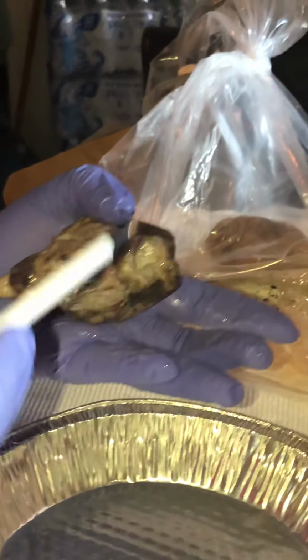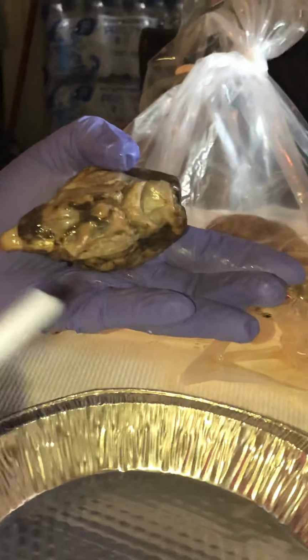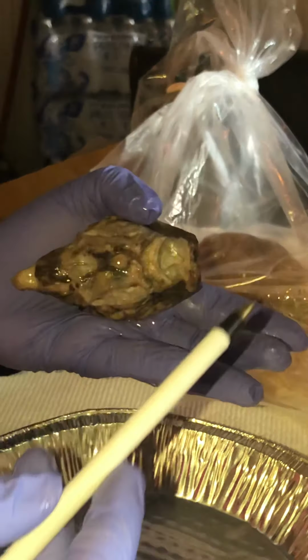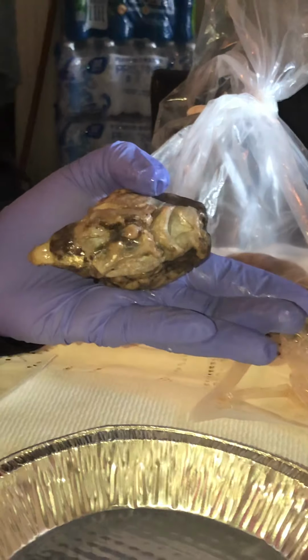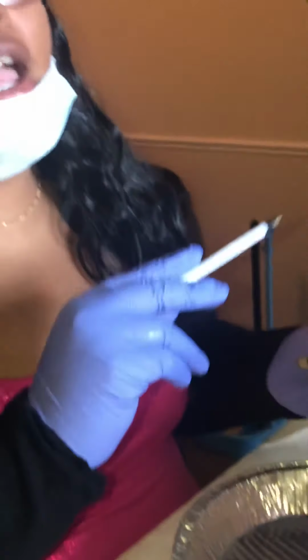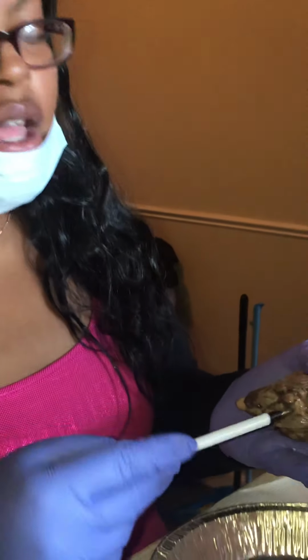Right here in the pons, this is where our motor signals decussate. They cross from one side to the other because the left side of your brain controls the right side of your body. So it has to go up and decussate, which means it transfers. You can think of it like a bridge: it crosses over to the other side to control the movement.